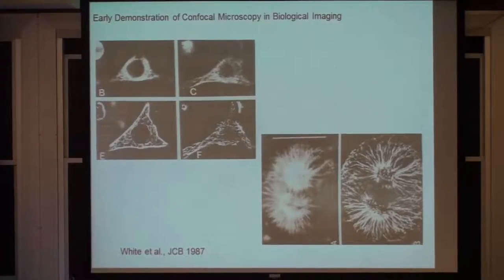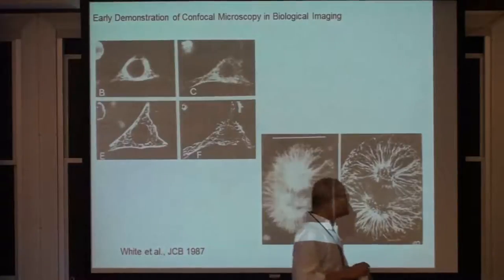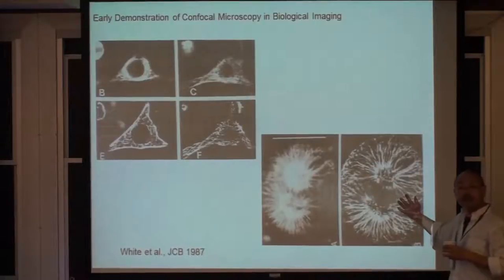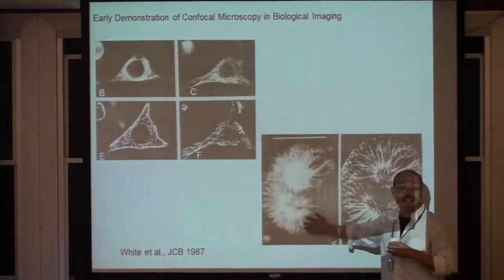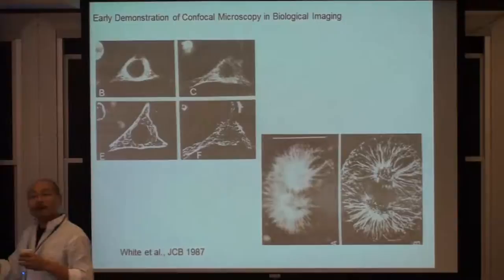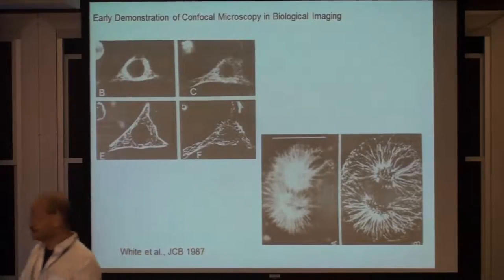John's group. And one of the things, actually today, you wouldn't think that it is impressive. But on the other hand, at that time, this is, I think, a sea urchin embryo looking at the microtubules. And one can see that this is a normal wide field image. So at the time when they started showing the confocal image, they were showing detail that you could never see before. People were tremendously excited. And by really presenting three-dimensionally resolved images, John and Bio-Rad and a large number of early investigators of confocal microscopy in some way started the field of three-dimensional biological imaging.